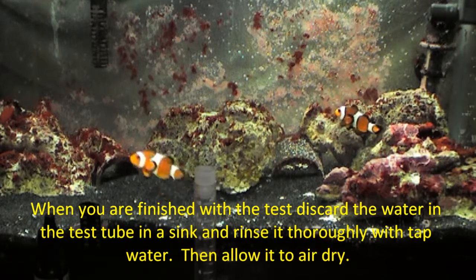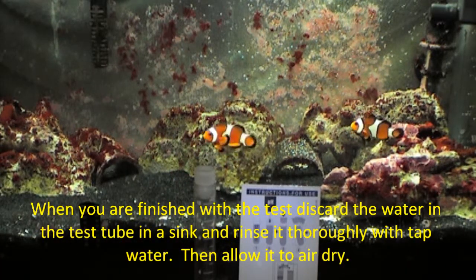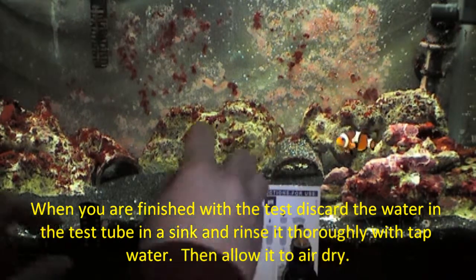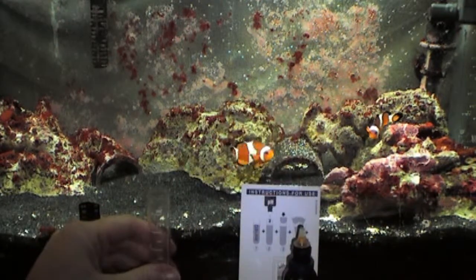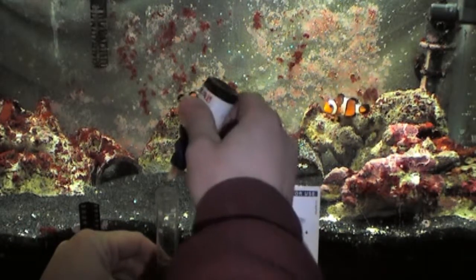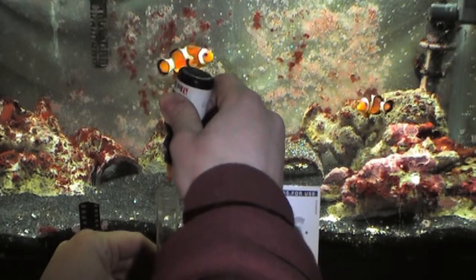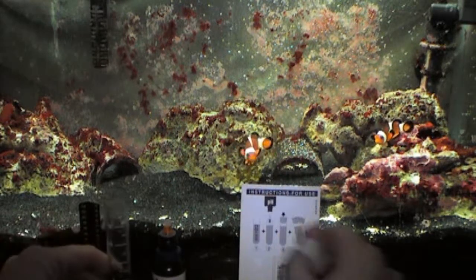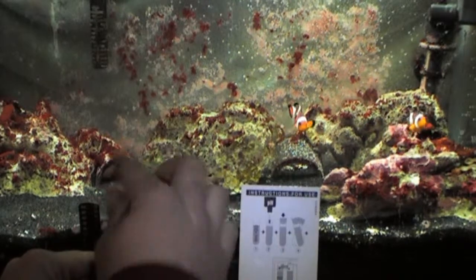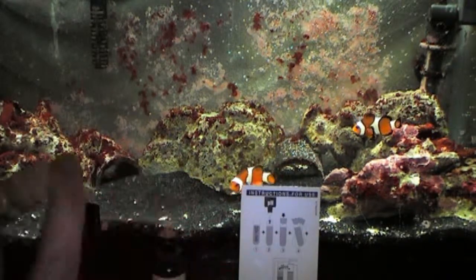So this test is pretty straightforward. All you have to do once you have your test tube with your six milliliters of water is add three drops of the indicator solution — one, two, and three. Cap it up, but you don't want to use your fingers; you need to use the cap that came with the kit.